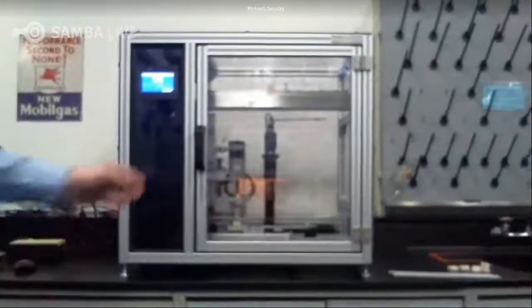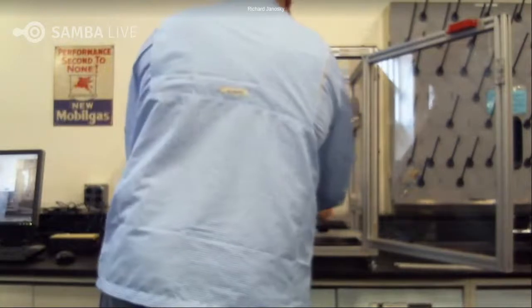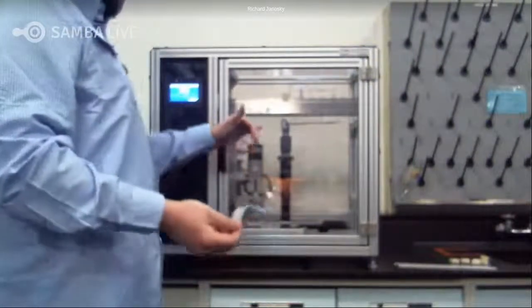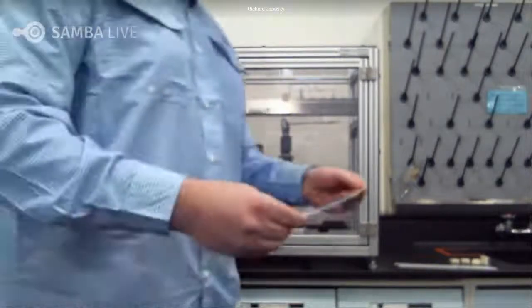All right. So I'll slide this back. Now take this out. So our sample slides out. The next step, and you'll have to come back next week to see, is in the analysis would be particle counting. That's what the flat camera is there for. So we'll be showing you how to do that next week. Come on back to see that.